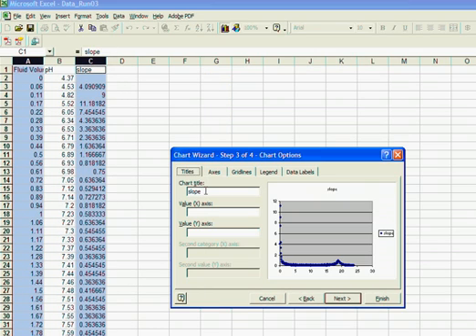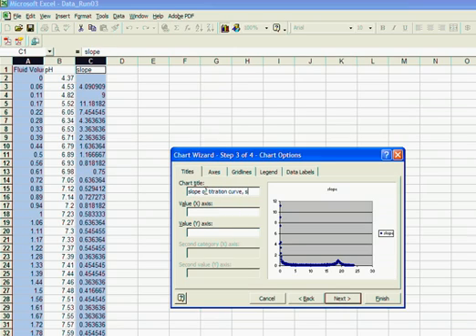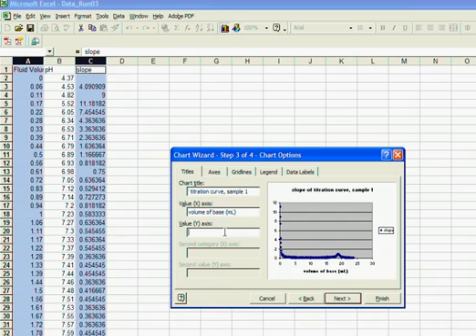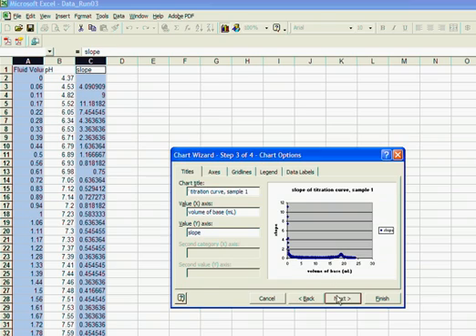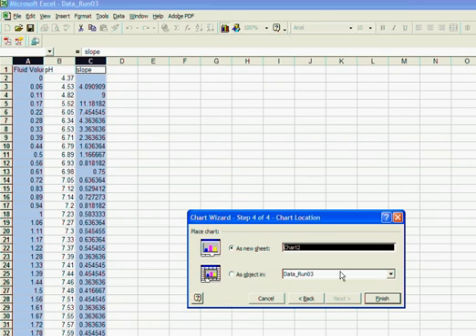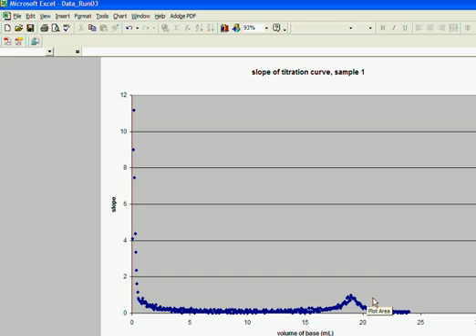I'm changing the title of the plot. I'm going to label the x-axis volume of base in milliliters, and I'm going to put slope as my y-value. Next, and I'm going to have that also as a new sheet.